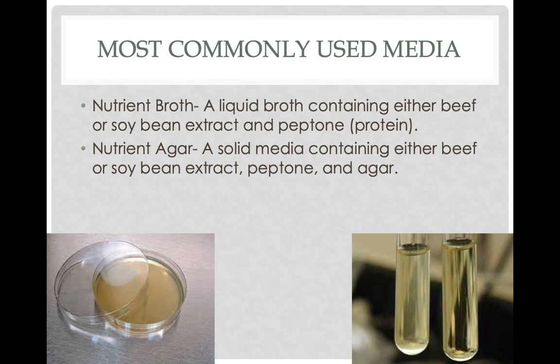So the bacteria, you will introduce them to this type of media. This is a general purpose media, which means that pretty much every type of bacteria can grow on it. It's not a specialized use. It's not meant to only grow Streptococcus or maybe one or two types of species, or not meant to grow just gram-positive species or just gram-negatives. But this type of media can grow pretty much everything you put on it.